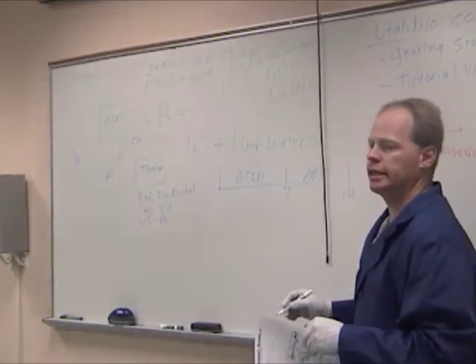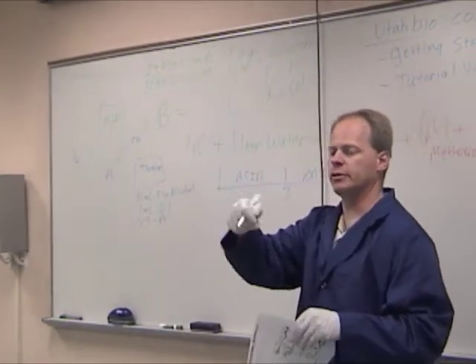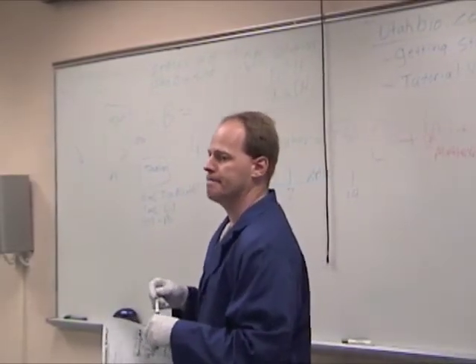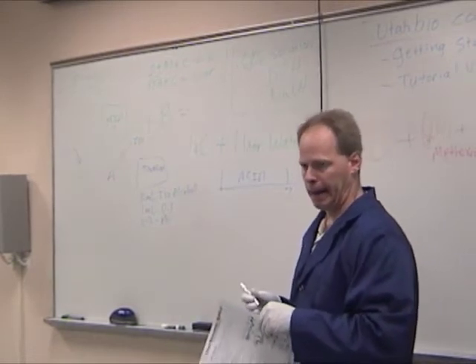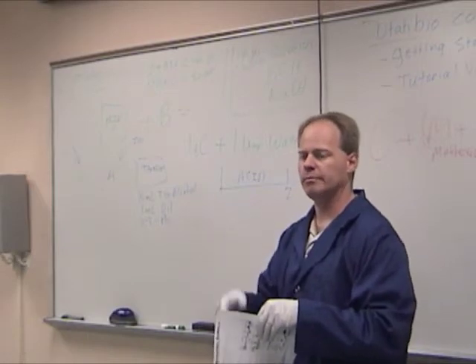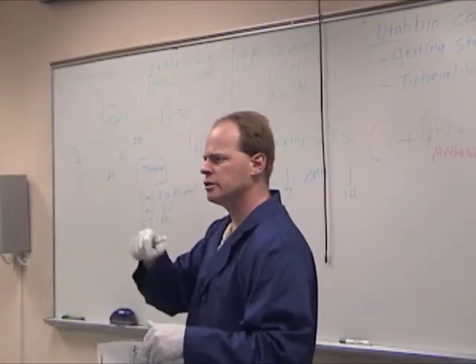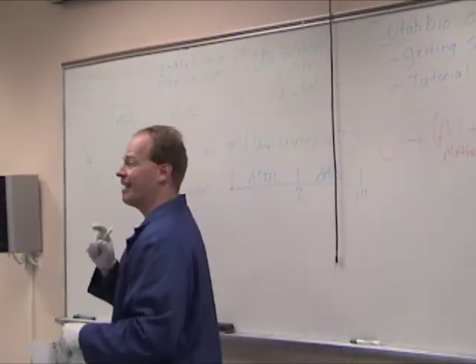You want to be able to indicate. Do you have any idea how much turmeric for a solution? Same amount, just a couple toothpickfuls. Well, to make your solution, you mean? No, you never use turmeric in your solution. Turmeric is your pH indicator. Don't you make a turmeric solution? You could, but people say it goes bad really fast. So just put the powder in your 10 ml. If any of you have ever attended a Gillmark class, she brings turmeric around because it's really easy to take on an airplane. Taking anything with alcohol in it is kind of dangerous.